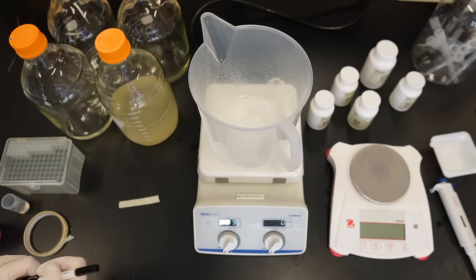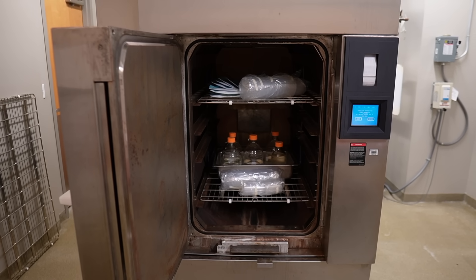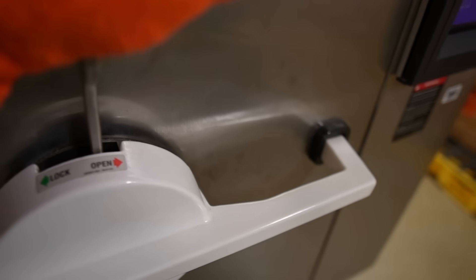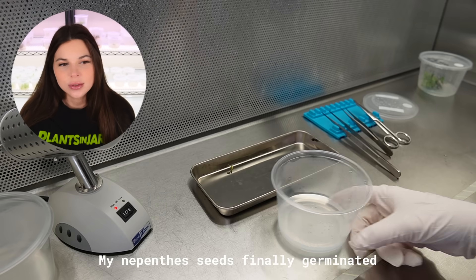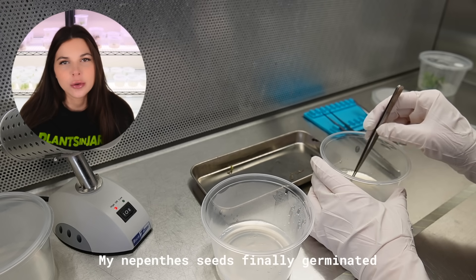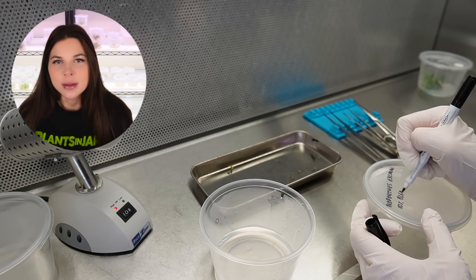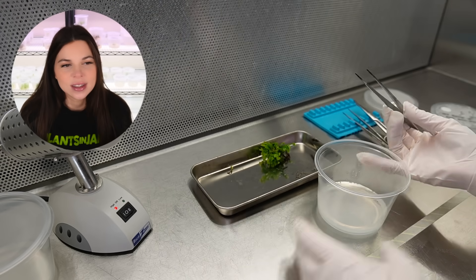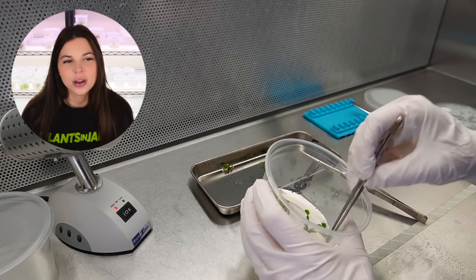Another small difference is how I handle the agar. Instead of adding it after adjusting the pH like I do at home, I add the agar directly to the media bottle and pour the media on top of it. Everything combines in the autoclave when heated at high temperatures. This setup is a little faster when I'm in the lab making multiple liters at once. Most plants ideally need to be subcultured every four weeks — sometimes you can stretch to six or eight, but more frequent subculturing gives better growth rates. Subculturing means transferring plants onto fresh tissue culture media so they have consistent access to nutrients and hormones.